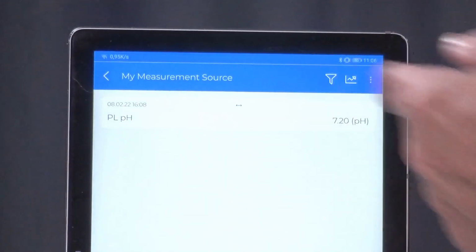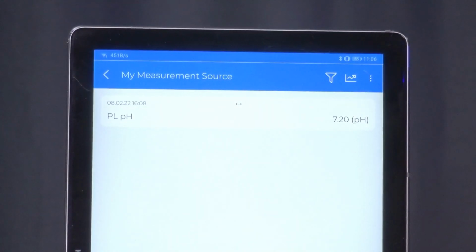I also have the possibility to choose the language, the unit with which the measured results should be shown, millimole, per liter, and so on, and all these things. And I have the possibility to turn on Bluetooth, because this device sends what it has saved with Bluetooth to a computer. There is a Windows software offered, which you can download for free, and an application for Android, and then I can transfer the data to a tablet or mobile and look at them.